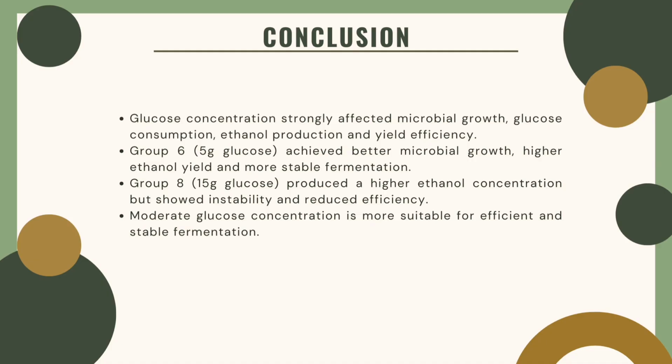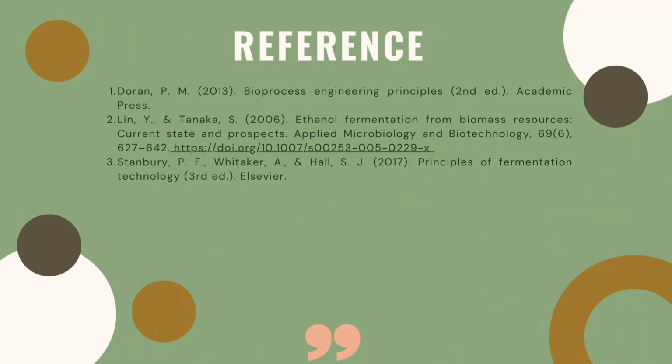Therefore, the moderate glucose concentration is more suitable for achieving efficient and stable fermentation performance in the bioreactor system. This supports the potential of bioethanol production as a sustainable alternative energy source.